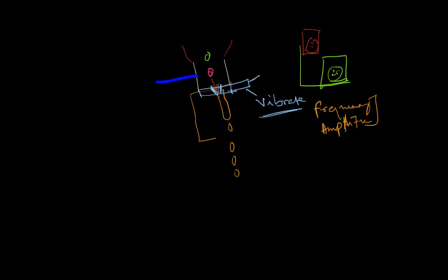The higher the frequency, the more droplets it generates per unit time, since it is vibrating faster. The position of the break-off, whether higher or lower, is governed by the amplitude. Basically, it's a combination of both frequency and amplitude that is needed to break the stream at a certain point. That desired point is called the drop break-off, or stream break-off.